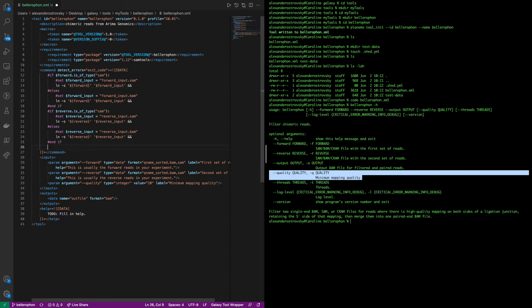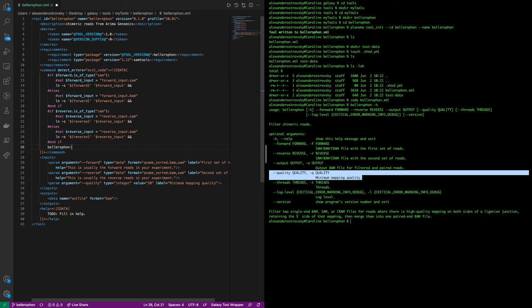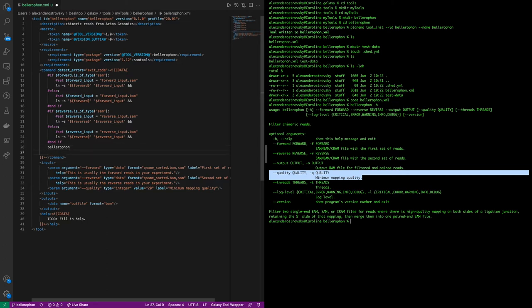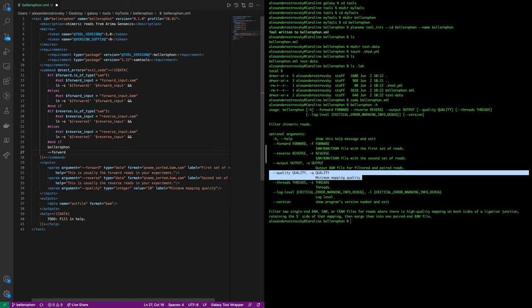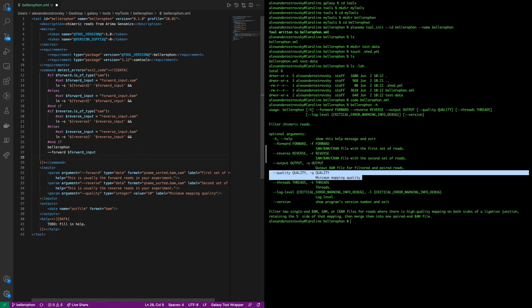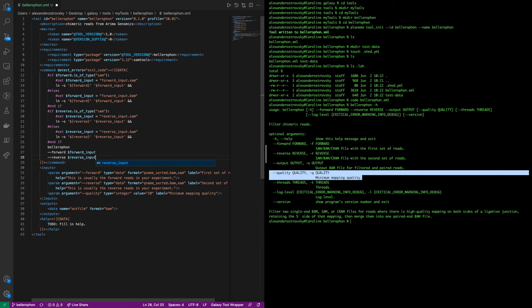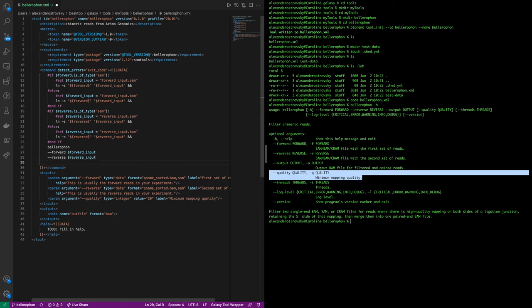Now we can create the actual Bellerophon command that will come after the symlinks are generated. We call Bellerophon, which is available because it was listed in the requirements as a package, and then we feed it the parameters as we would on the command line. So I hand it the forward flag and then give it the variable we set forward input. So it hands it the file with the user input in the GUI. We do the same with the reverse now, with reverse input, which we set as a symlink.